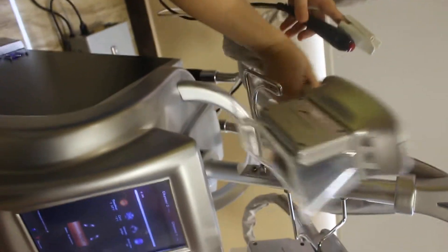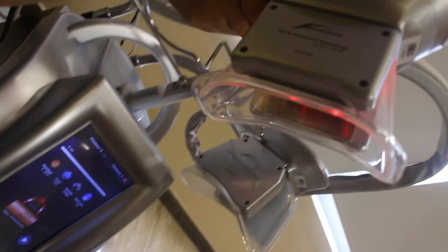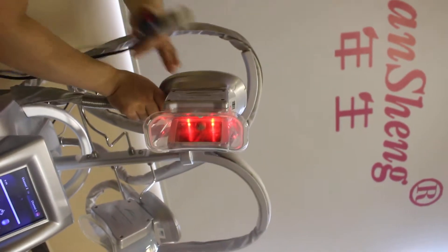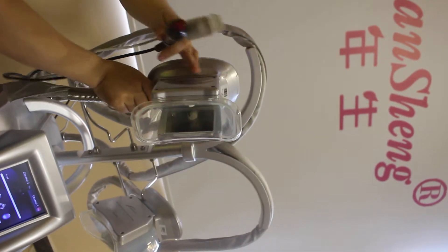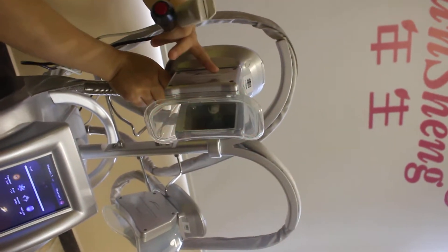You also need to press Start here. Now it's pre-heating. Because we chose 1 minute for pre-heat, it will pre-heat for 1 minute.